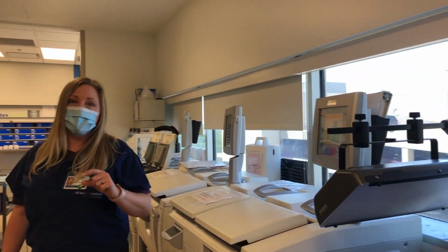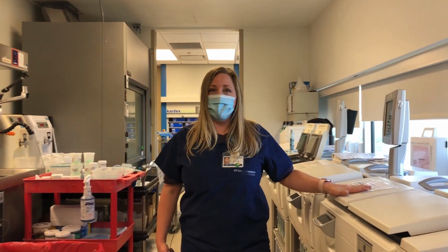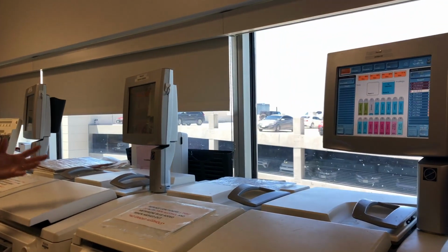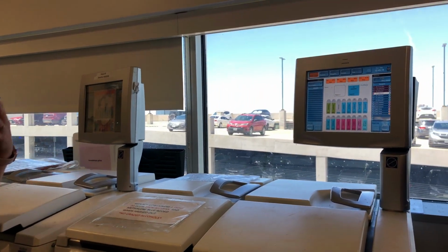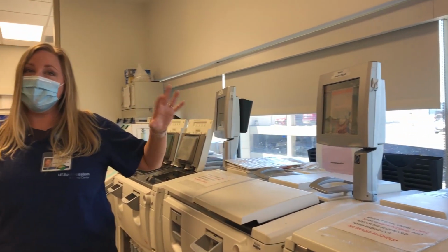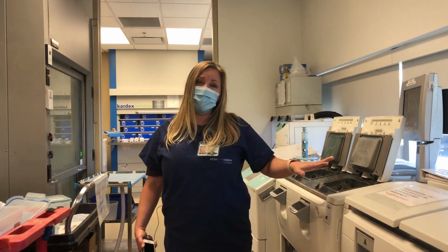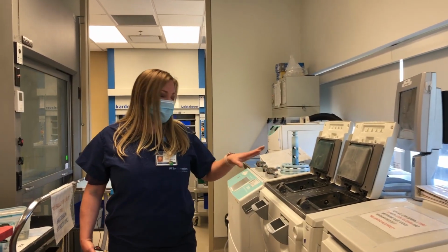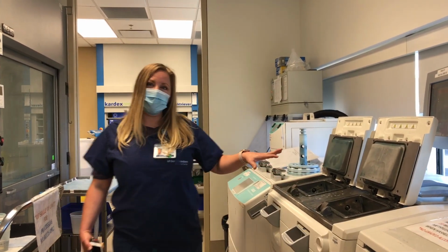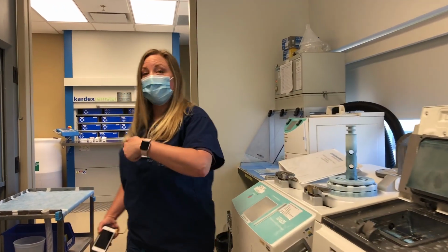Once we have a block of tissue or a smaller cassette of tissue, we actually need to infiltrate that with wax. So basically the water that's in the specimen needs to be removed. We have to desiccate that out with a series of alcohols and infiltrate that with wax to give it some rigidity so those can be cut in very small sections. This part is actually done overnight for us. It's a 2-hour process for biopsies to an 8-hour process to have all those tissues come out very perfectly, to arrest the tissue exactly where it needs to be after it's fixed, and to get it ready for cutting.